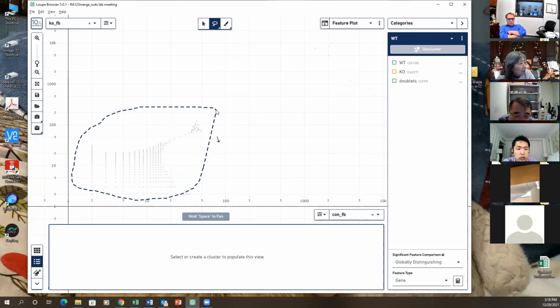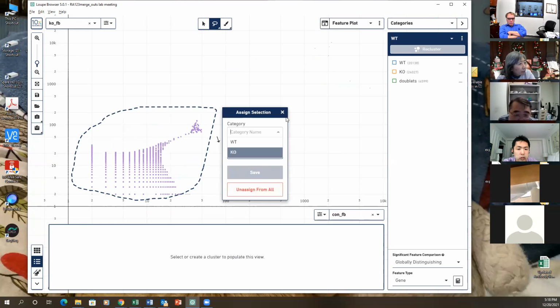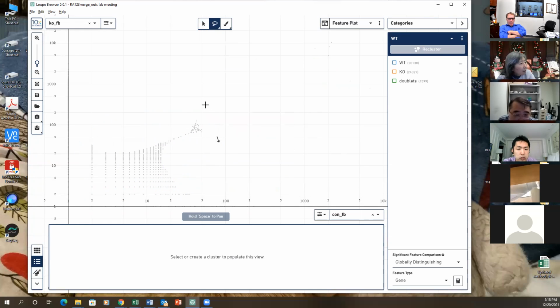No, you still have a few cells left. You don't want to have any leftover cells where you miss some. You see? Well, that's close enough. Let's just see what goes. When you analyze, you will see some trouble, so you don't want to miss any. Yes, you try to cover everything. Draw a big, huge gate.